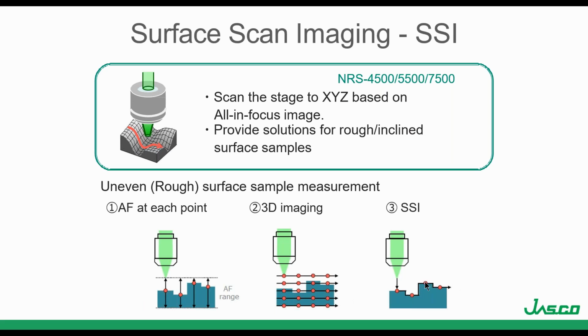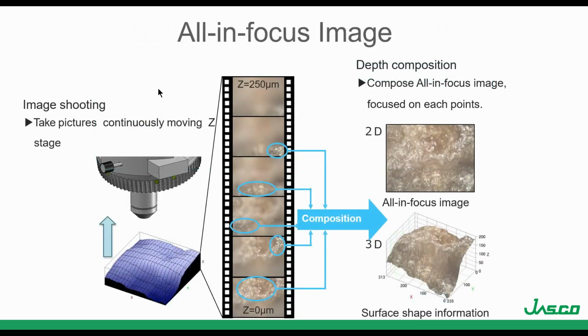Then it's going to raise it, and it's going to take it in the next one. But the way that is done is with a feature that we call all in focus. And actually what we are doing is just stitching all the images. The stage is going from 0 microns, in this example to 250 microns, and actually what the stage is doing is moving.